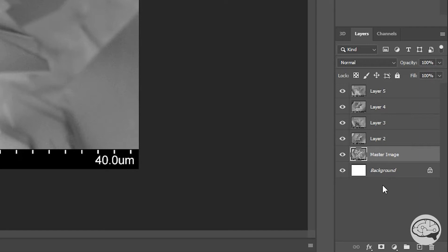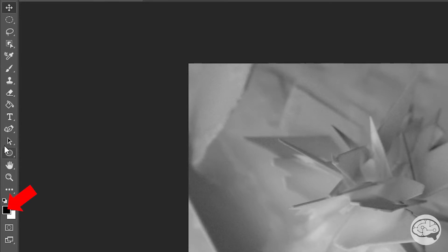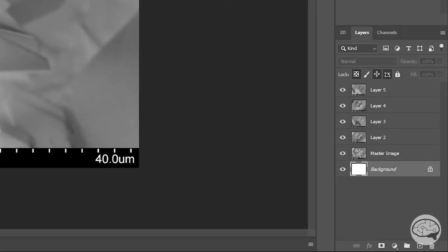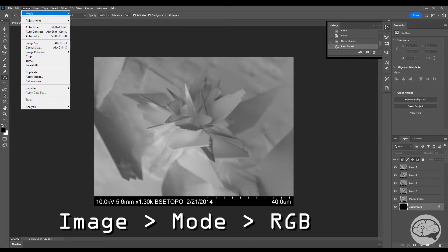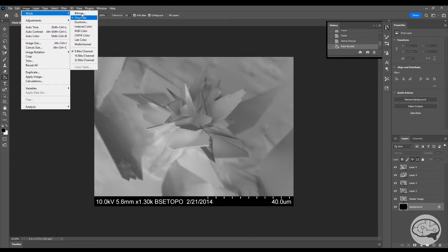We also want the background layer filled completely black. To do that, we'll select the background layer. We'll go over to the other side of the screen and make sure the top color layer is black, then select the fill bucket and click on the image. That should fill our background completely black. We'll also make sure that this new image is set to RGB or CMYK color.